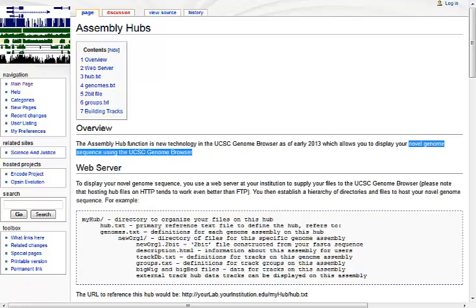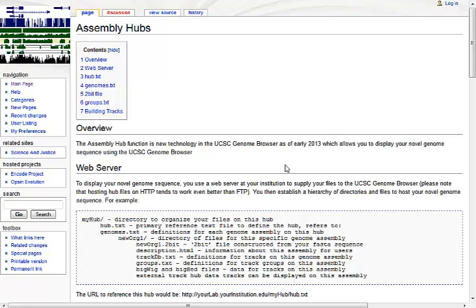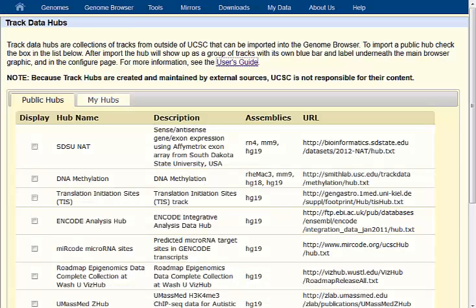The Assembly Hub lets you display novel genome sequence using the UCSC Genome Browser. Again, you don't have to install and maintain a local UCSC Genome Browser — you can use this existing mechanism to load up a new genome and your annotations and explore those with your team. The Hubs give you a lot of extended functionality beyond just creating a custom track to load up something and look at it; they provide a lot more opportunity to load up large data sets. Track Hubs are the mechanism you want to check out for that.